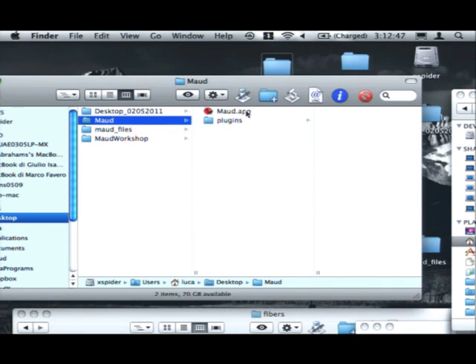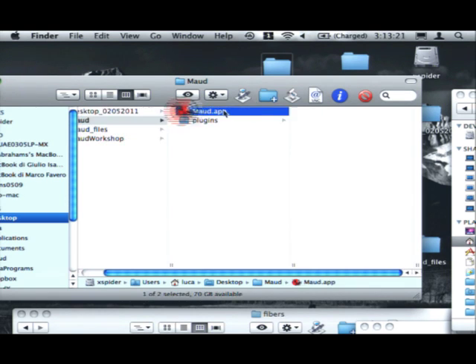You only need the program, which on Mac is like this one, and the plugin directory. On the other systems, you see a little bit more, you see directly the jar. So on Windows, you start by pressing MAUD.bat, and on Linux, you can use the .sh. Or you can just type the command line. If you edit the MAUD.bat or the MAUD.sh in Linux, you see which command line is used to start the program, and so you can use that one.